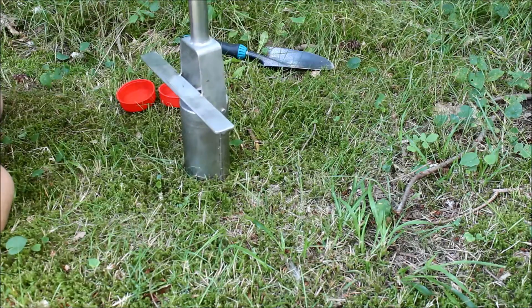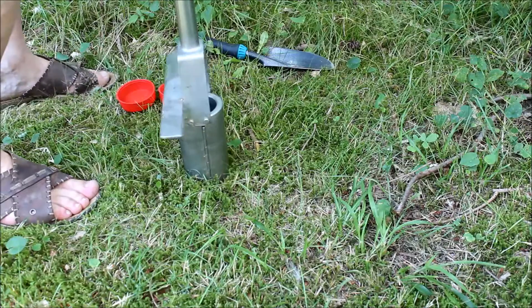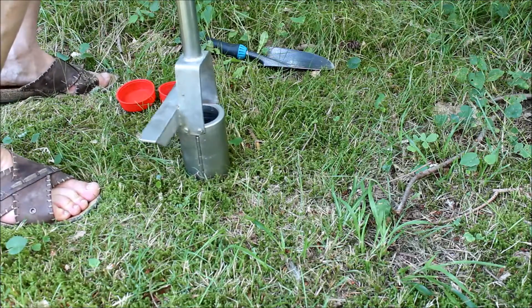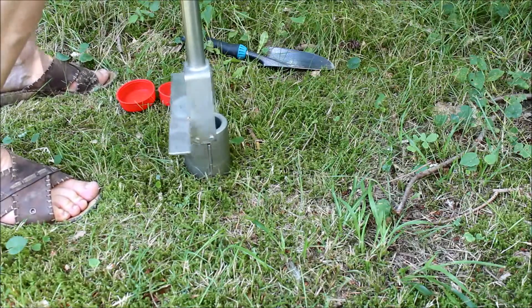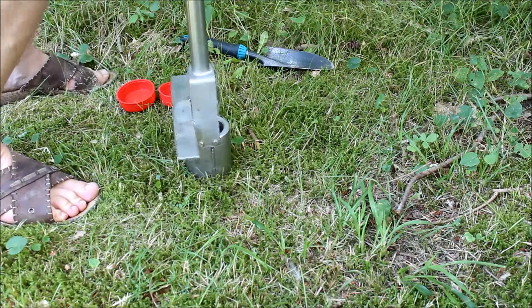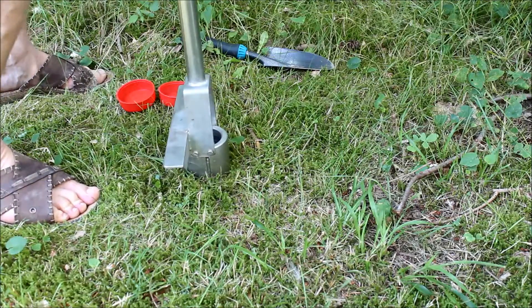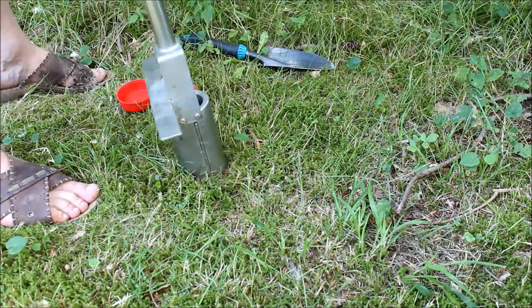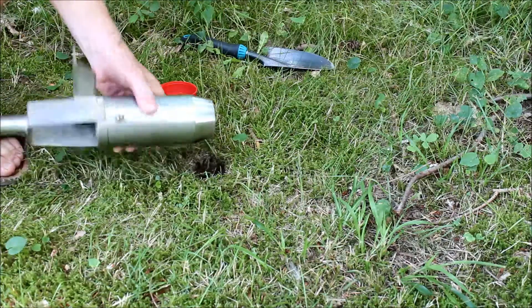So that's why I'll do it like this. And then I will press down, squeeze it and turn it a little bit around until I get a sample of a little bit more than five centimeters in depth, which I've reached now. And I'll take it up and look at how it happened.